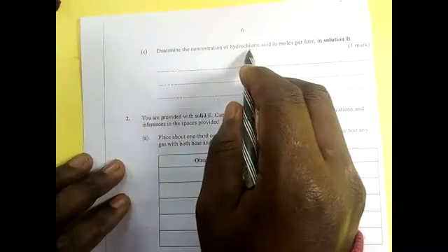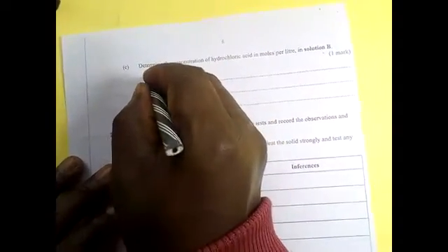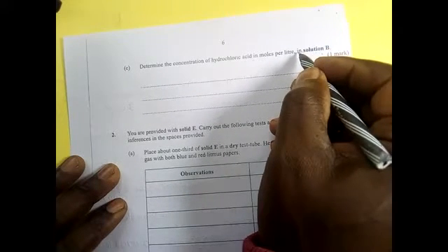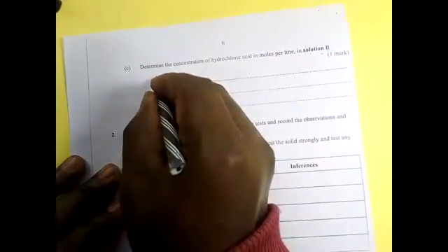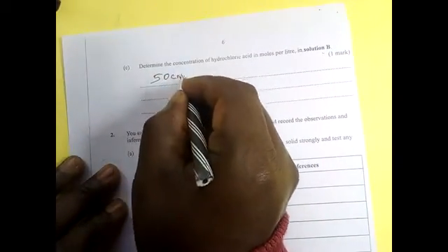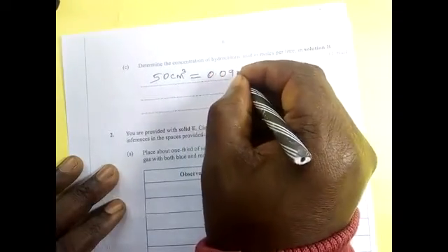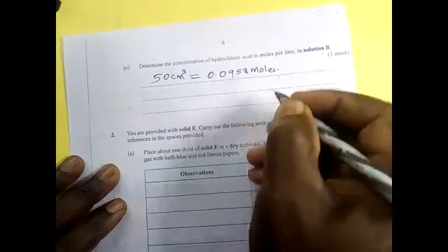Determine the concentration of hydrochloric acid in moles per liter of solution B. Now we have the number of moles in 50. Remember, initially the total volume of solution B that was used was 50 centimeters cube, which contains 0.0958 moles from our previous calculation.